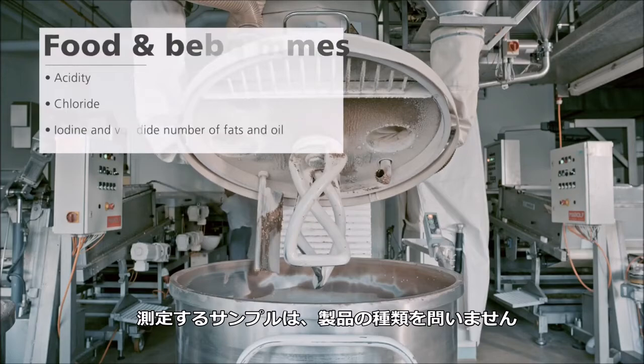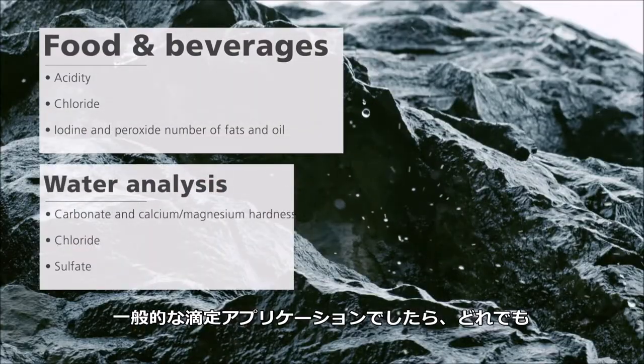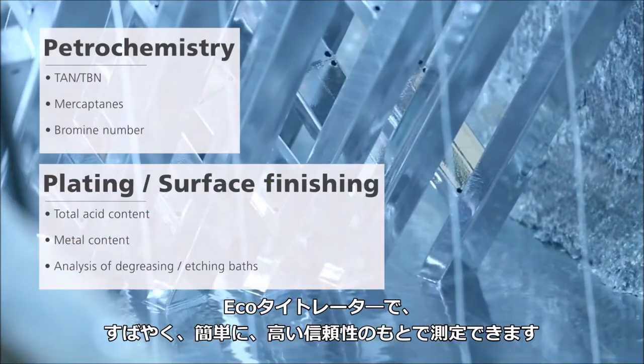No matter what kind of products your company manufactures, all your standard applications are performed fast, easily and reliably on the EcoTitrator.